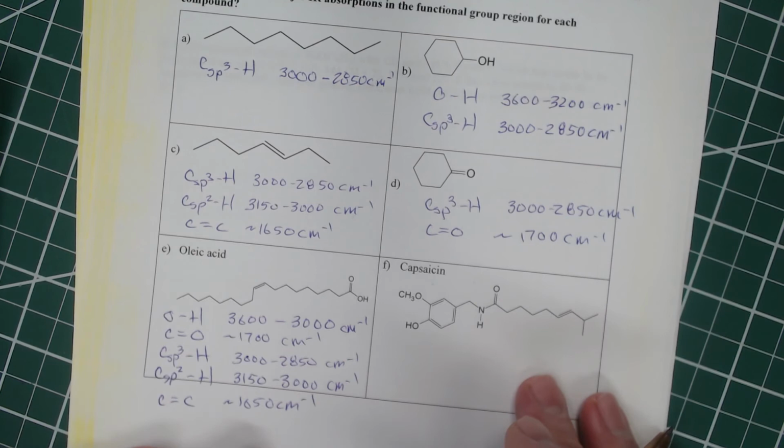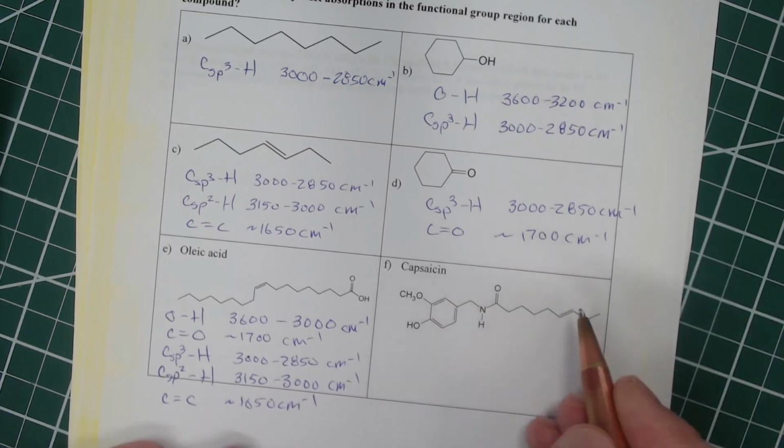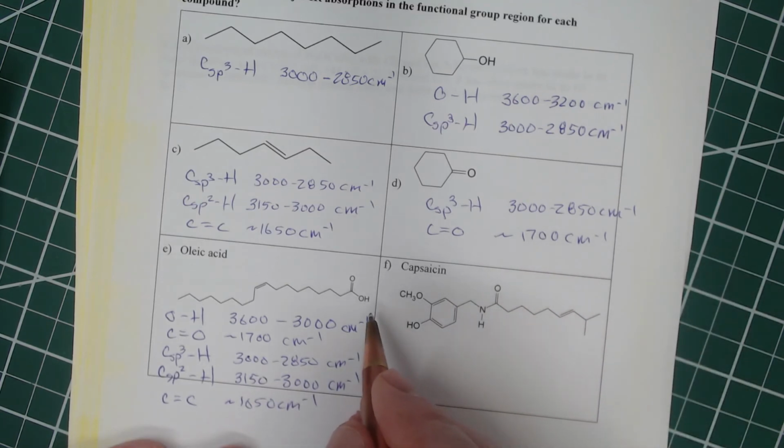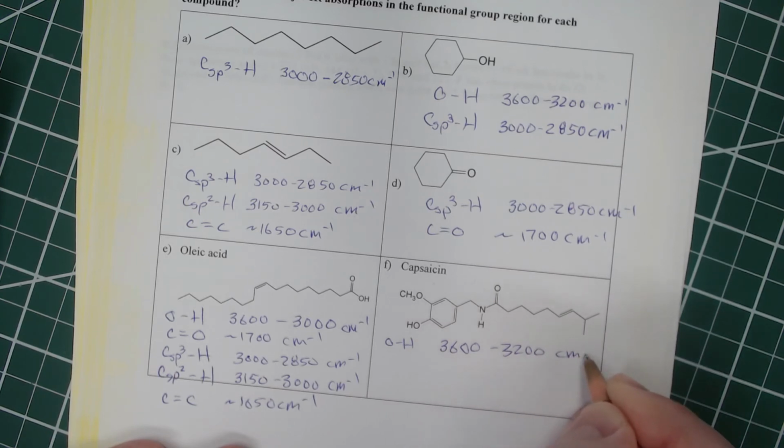All right, this one, there's a lot going on here. So we'll just go through the list. I would say the most distinctive peak in this is probably going to be the carbonyl, but let's just kind of work our way through. We'll start with the OH. So the OH will be 3600 to about 3200. All right.